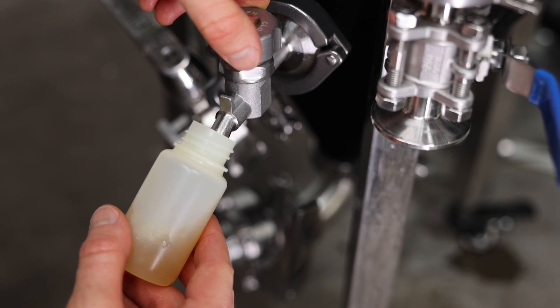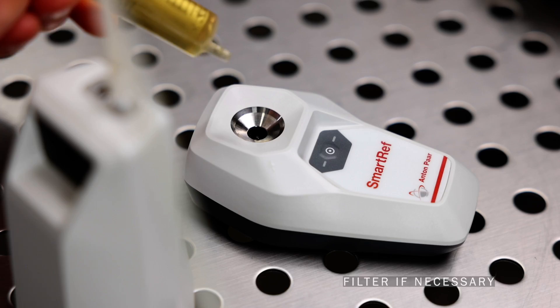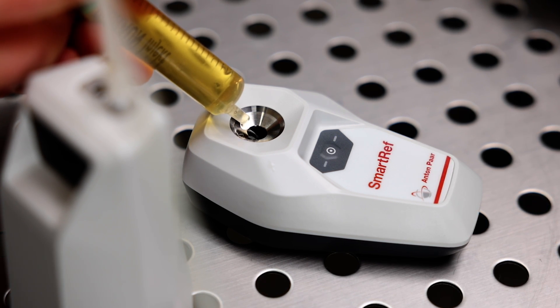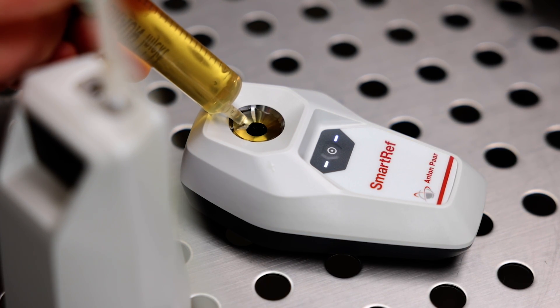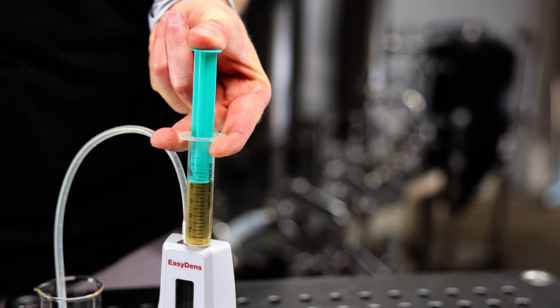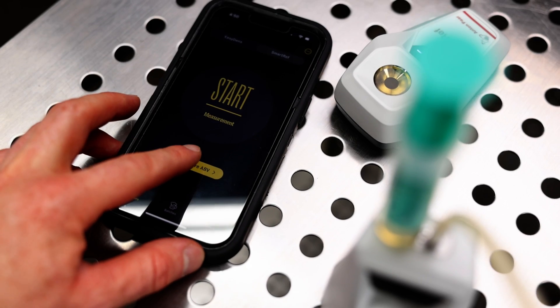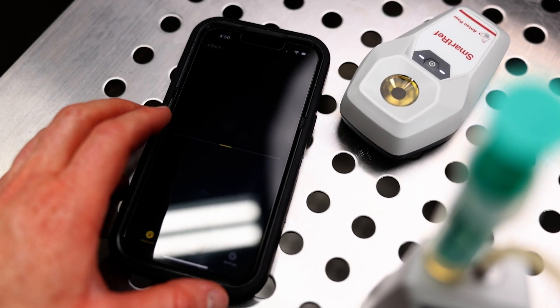We're going to take a small sample from the fermenter and degas it. Then add some of the beer to the SmartRef and the remaining beer to the EasyDens. Hit start on the Brewmeister app and let the meter combo go to work.